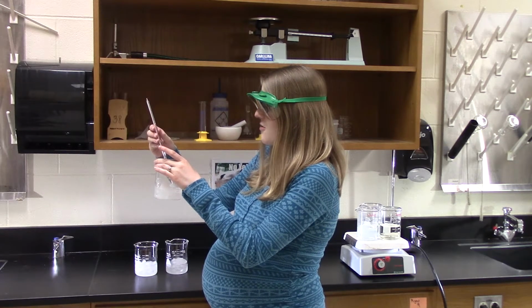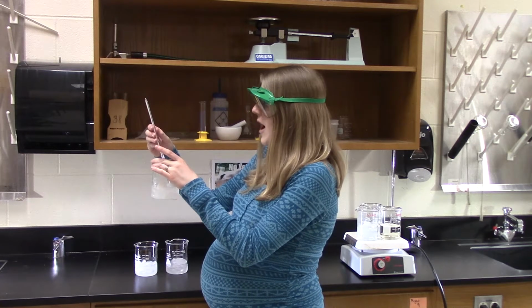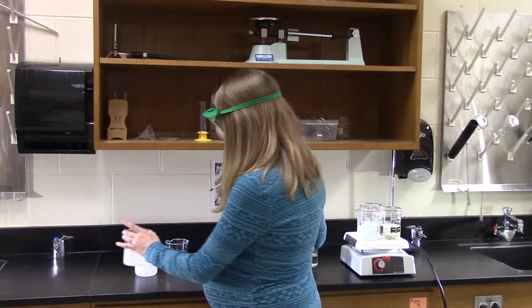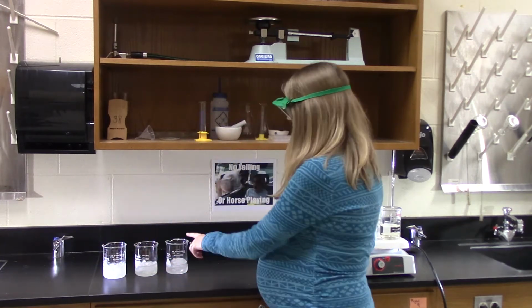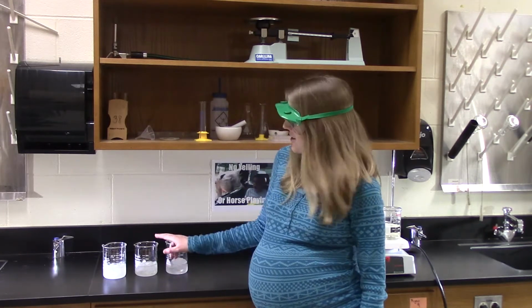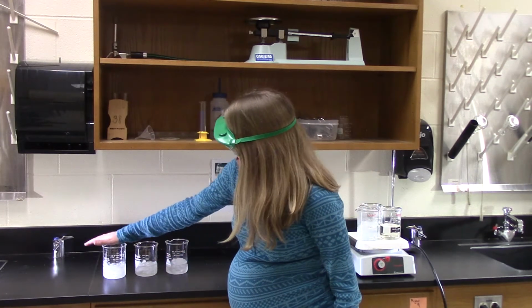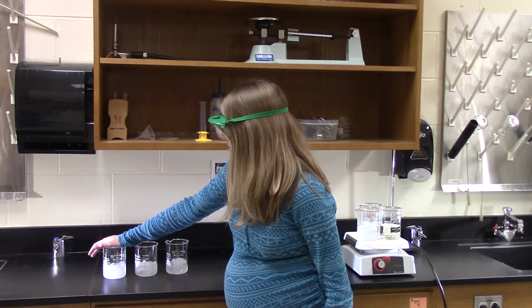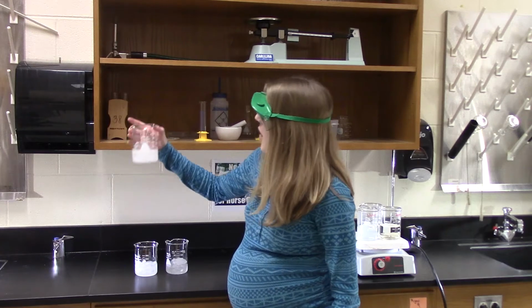Okay, still going. Wow, -9. -9 degrees Celsius. Did you catch that? 3 degrees with no solute, 1 degree with a non-electrolyte solute, and -9 degrees Celsius with an electrolyte solute. So why? Because this has a lot more particles because it breaks apart into its ions.